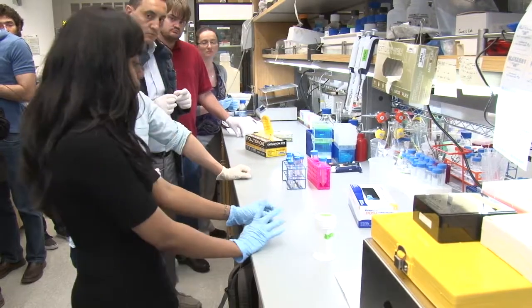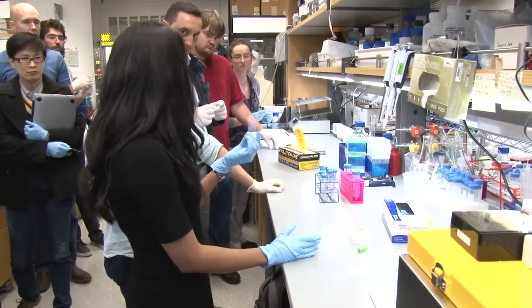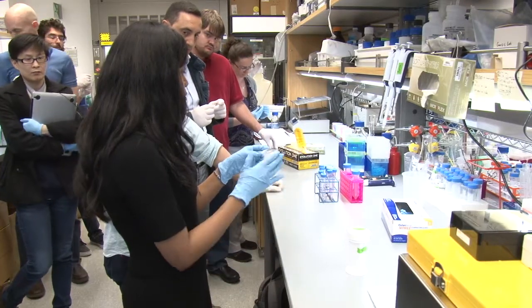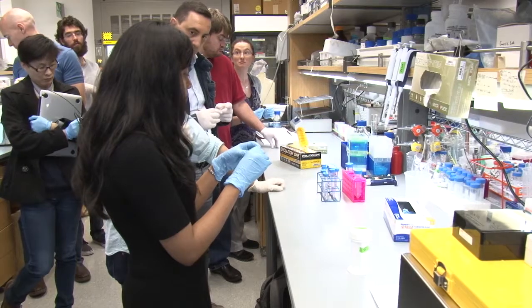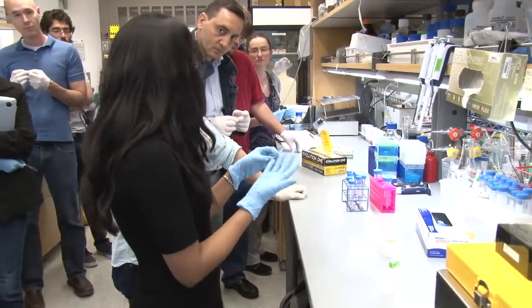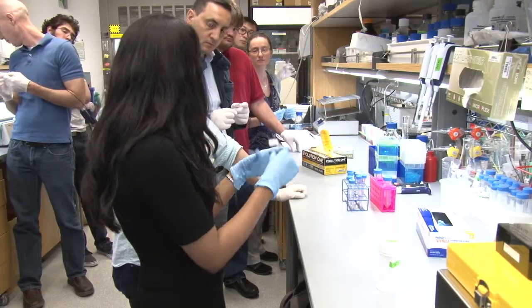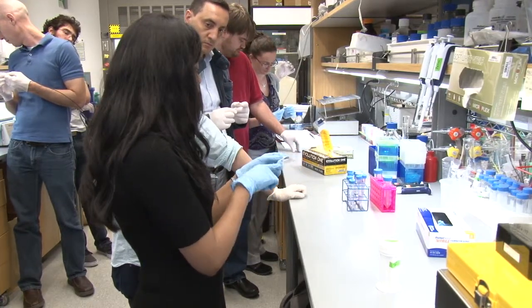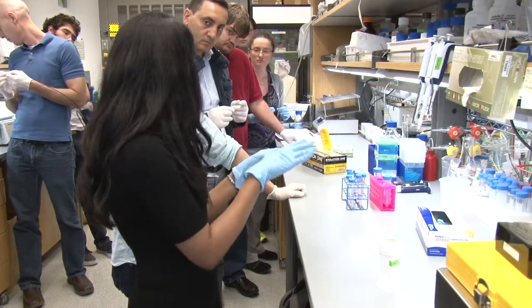You're going to cut your cryoblock and collect sections onto a superfrost slide. We usually cut 20 microns, so this is a 20 micron section. If you were to use paraffin blocks, then you would cut typical 10 micron sections. The protocol explains how long you need to air dry them — you would air dry for at least 5 to 10 minutes just to make sure the sections are adhered to your slide.